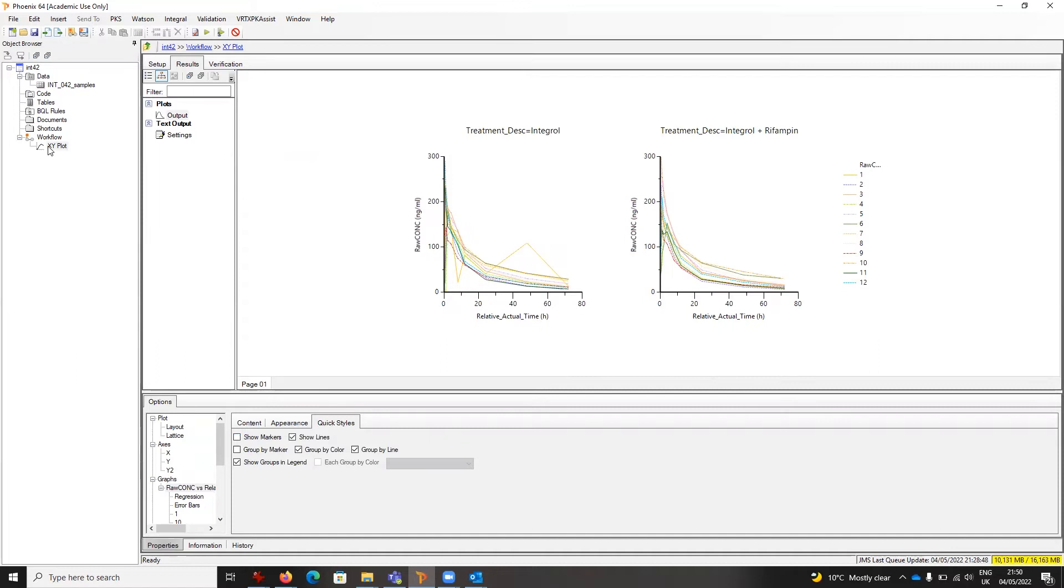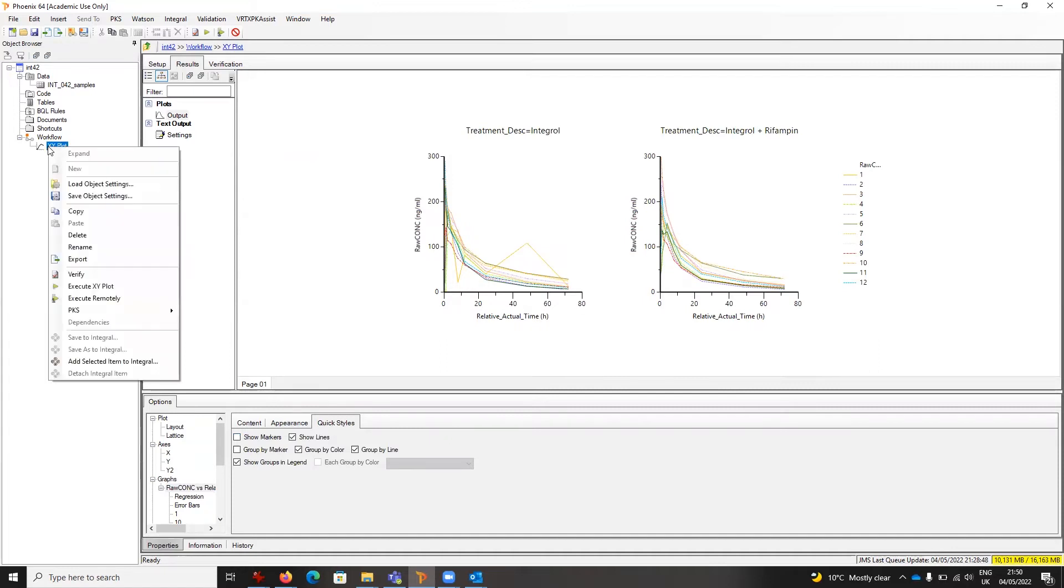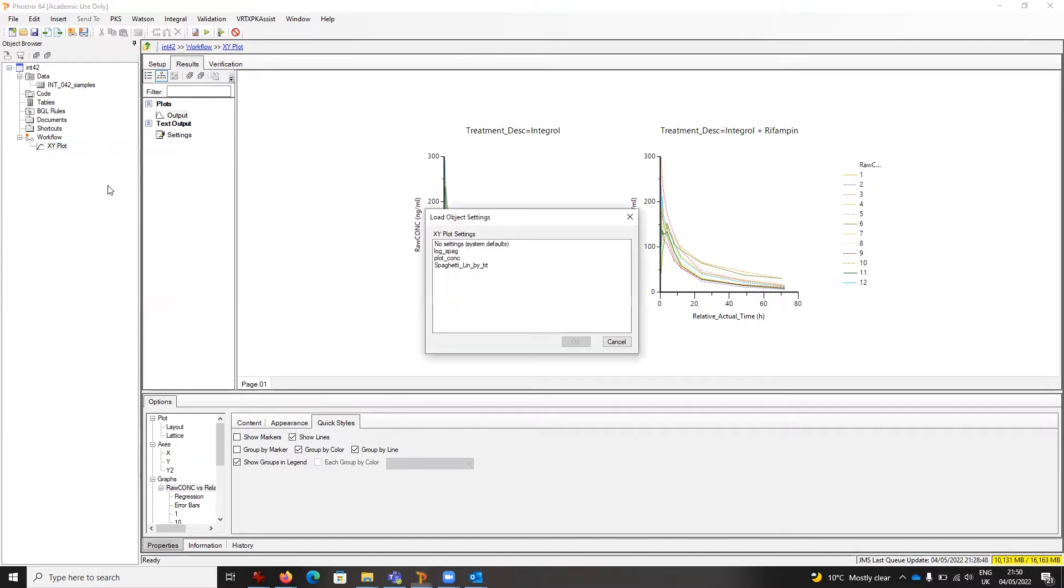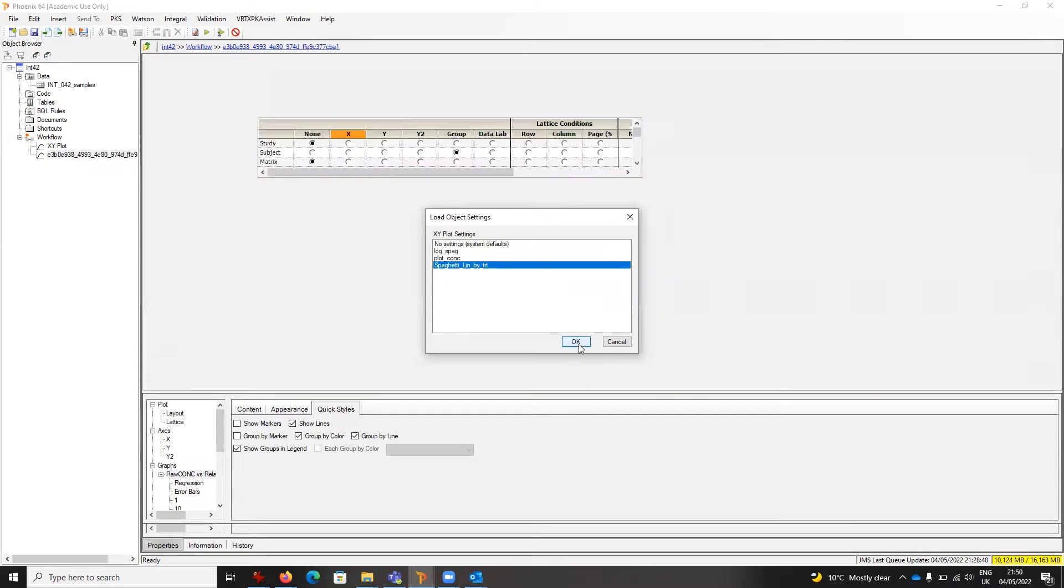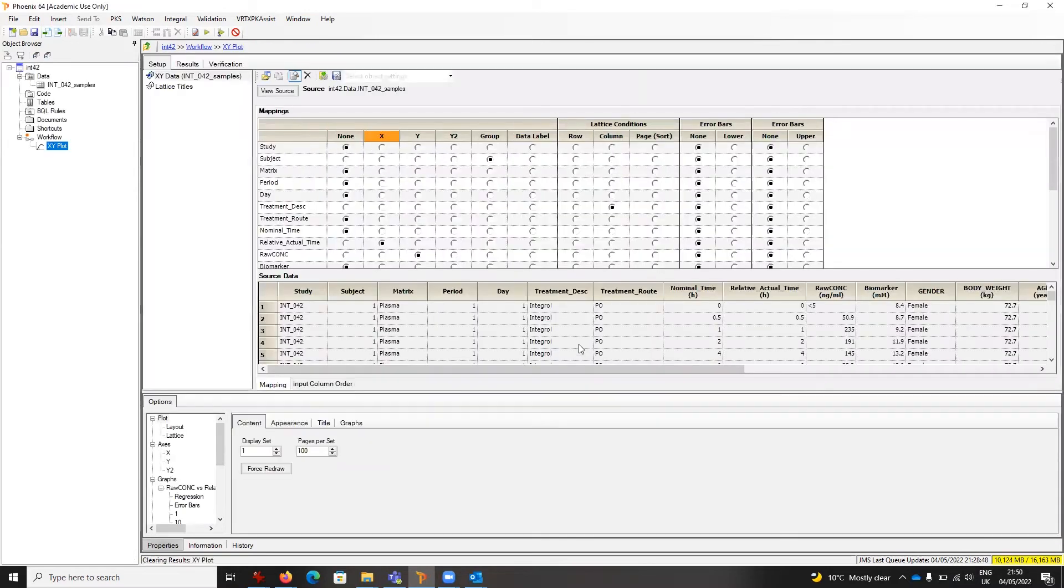So I right-click, choose Load Object Settings, choose Spaghetti Lin by Treatment, and say okay. Now I have that loaded. It resets potentially the mappings here, as well as the formats. I'm happy with that, so I click execute.